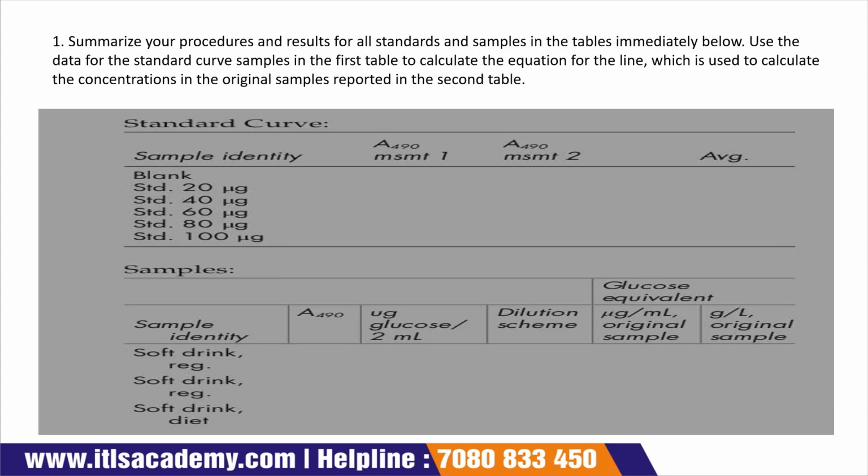Now summarize your procedure and results for all the standards. This is your data and calculation step. Okay, the procedure part is completed. Now you have to summarize your procedure and results for the standards and samples in a table. This table is used for this purpose.